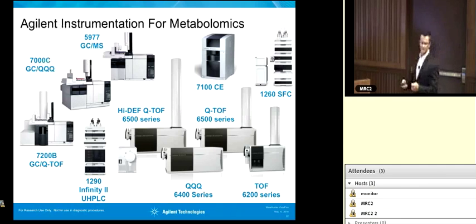We needed to get our feet wet a little bit with flux analysis, algorithmically speaking, because it is very challenging. So what we're looking at here is a trace of EICs, and along the bottom you can see all the way out to an M+7. So this was a 7-carbon metabolite that we were looking at. The dark black trace represents the total sum of those EICs, so that's everything together. If you just look at this visually, there's about 4 different places where our data could really live: 1, 2, 3, and 4.